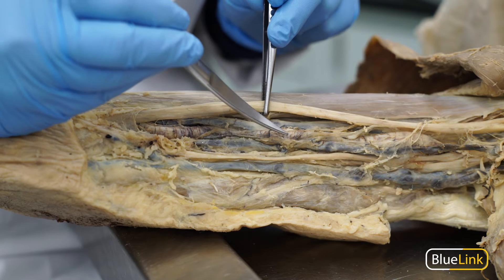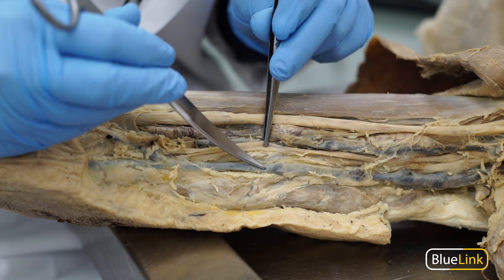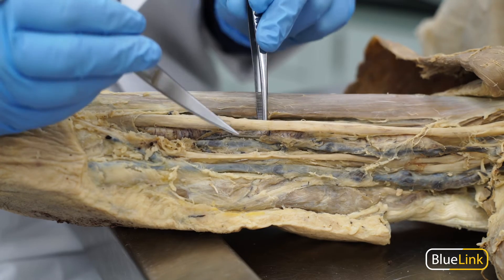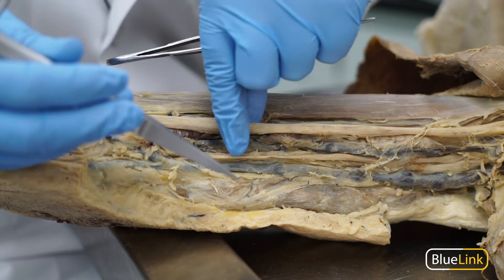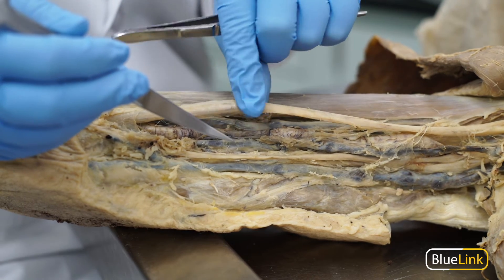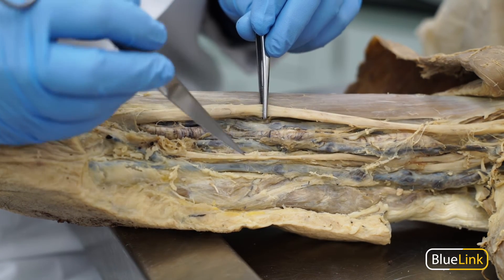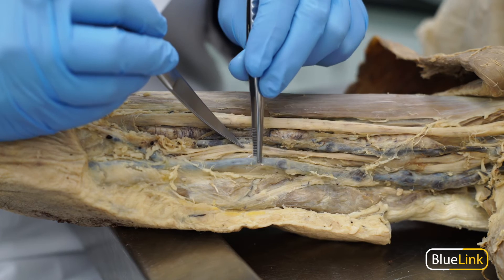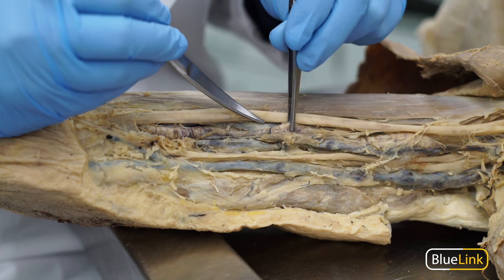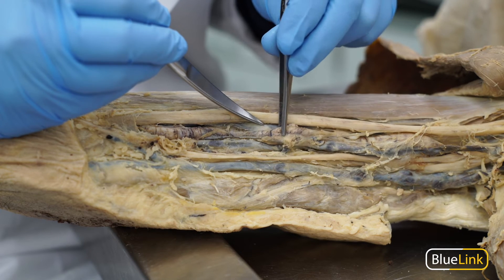Here we have an artery — you can see the walls give in beneath pressure, and similarly you can see the same for the vein here. Whereas if we were to press or feel a nerve, you wouldn't feel any walls collapse because nerves are solid. Typically, arteries don't appear as blue as veins because veins have thin walls that allow you to see through to the blood within. Arteries have much thicker walls, so it's not as easy to see the blood, and therefore they typically appear more white in color.